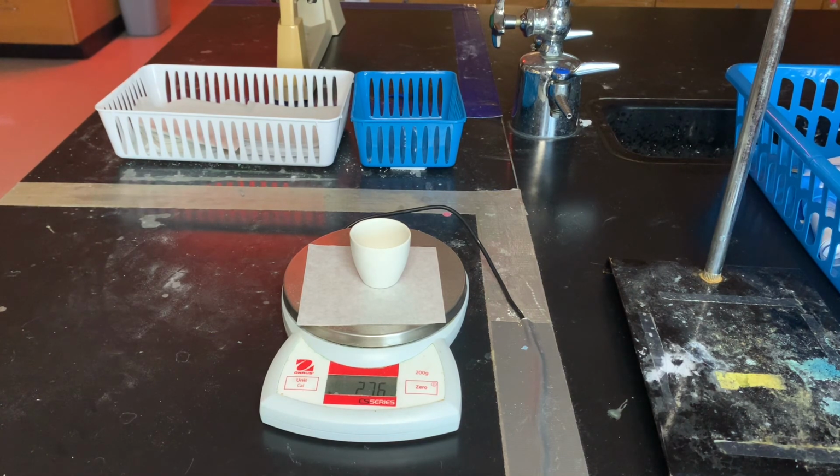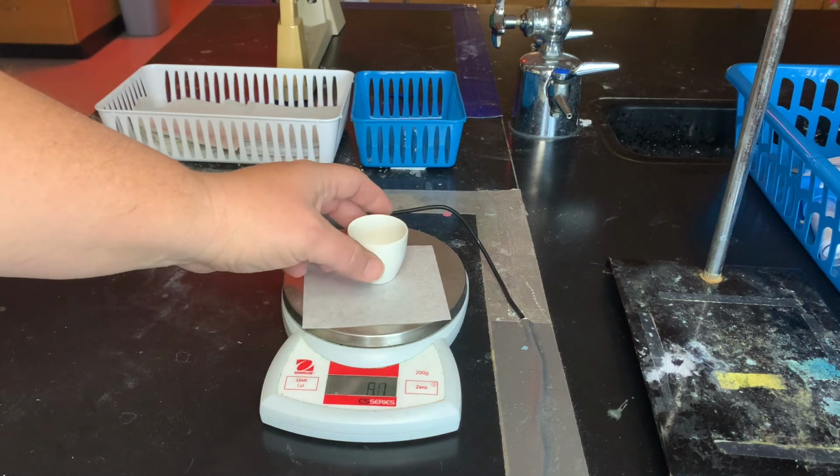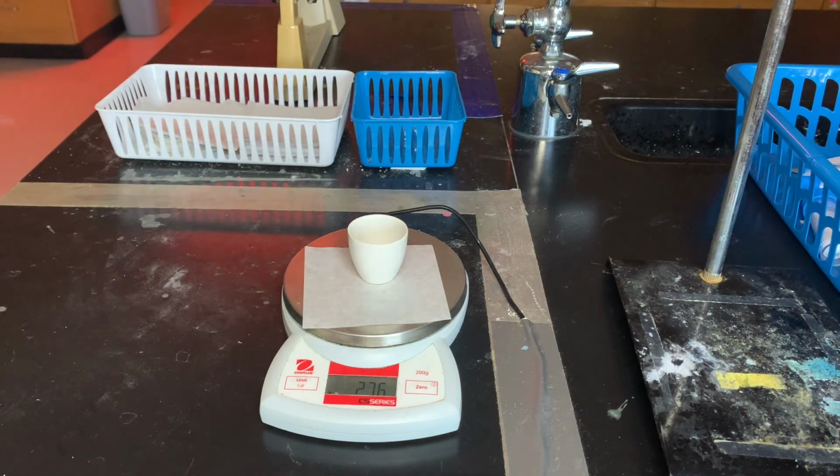Okay? Dispose of everything in the waste bucket. As always, you'll simply dump your contents of your crucible out and leave it at your station for the next team.